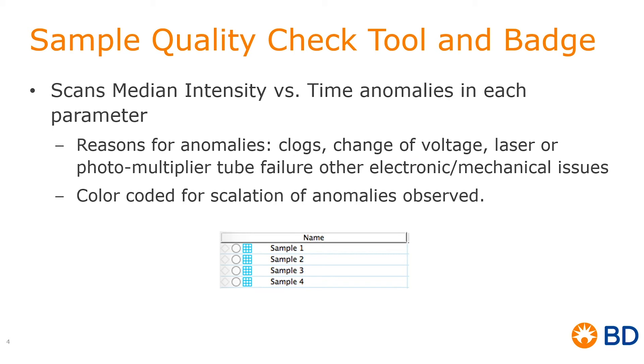or photo multiplier tube failure as well as other electronic or mechanical issues. We have color-coded the different levels of anomalies observed, and these go from best to worst in blue, green, purple, and red.